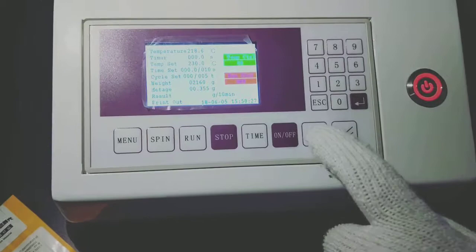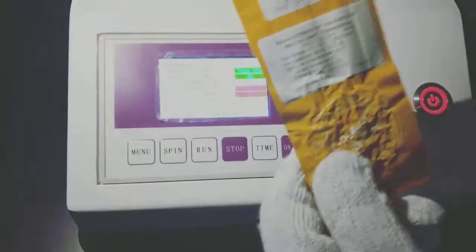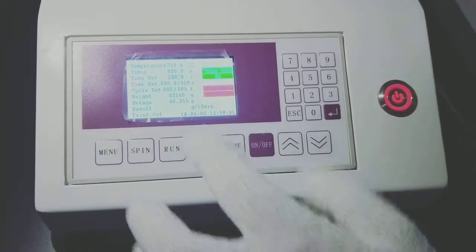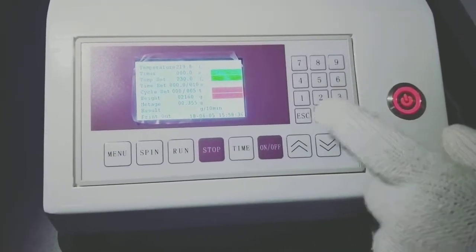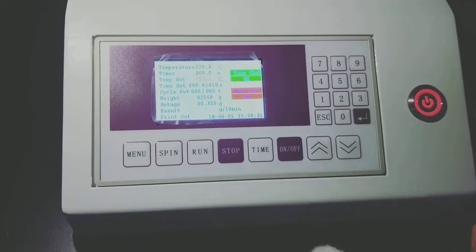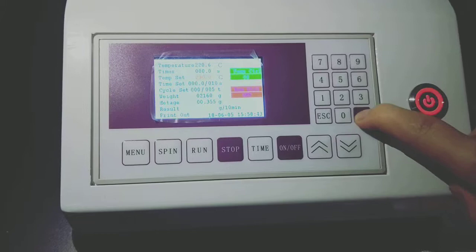And this is moving key. For example, we use this standard material to do the test. Its testing temperature is 230 degrees. We input 230, then press enter.